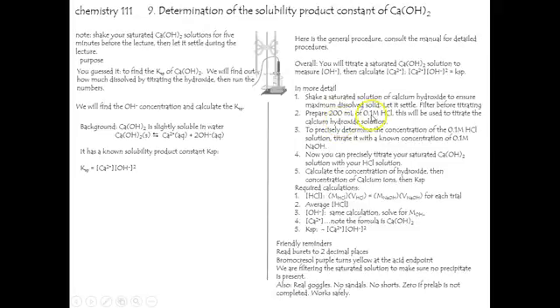Now, by doing that, we don't get a particularly precise measurement, so to standardize that solution, meaning to get its precise concentration, we'll do a titration of this stuff with sodium hydroxide. That's the first titration you'll do, and recognize that it has nothing to do with the calcium hydroxide. It's just to standardize the 0.1 molar HCl solution that you've prepared. So you have a precisely known concentration of 0.1 molar sodium hydroxide in front of you.